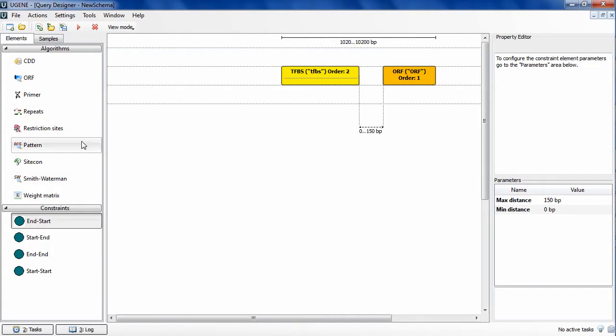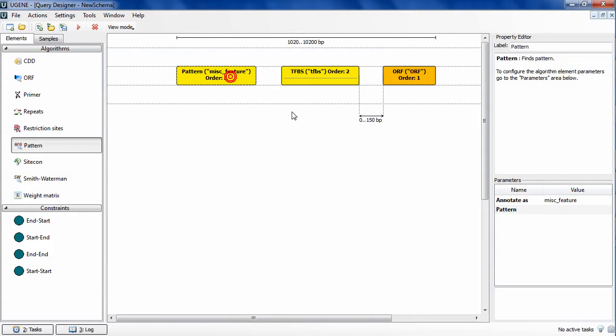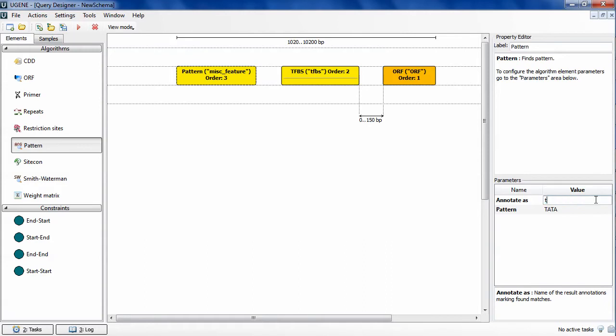The next element to add is the pattern element. I drag it onto the schema and set the TATA search button. Also I change its label and annotations name.